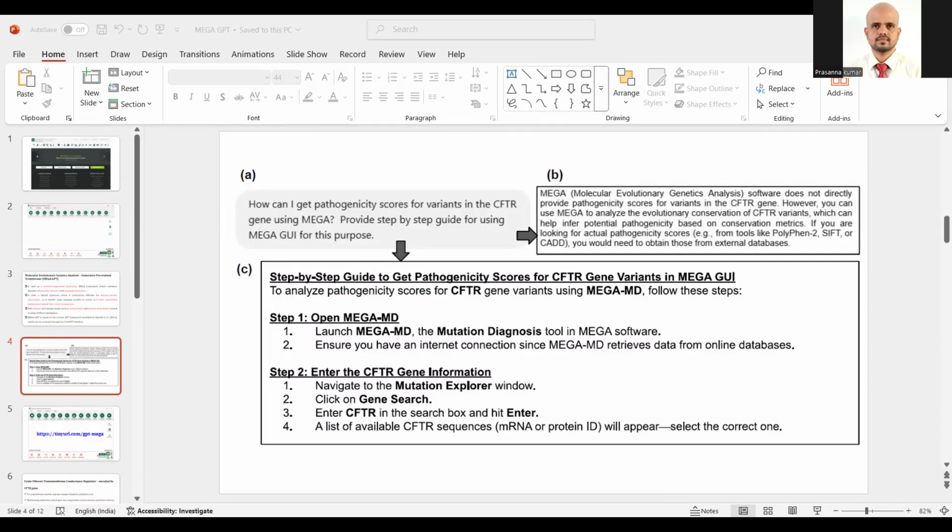We are going to study the mutation at a particular region. Okay, let me consider this particular site among the multiple sequence alignment that is being shown here. So this is a multiple sequence alignment you have here. I want to study this particular site because I feel it is parsimonious. Here I will go. I want to study tryptophan. At this site, if it is substituted by tryptophan, what will be the effect?